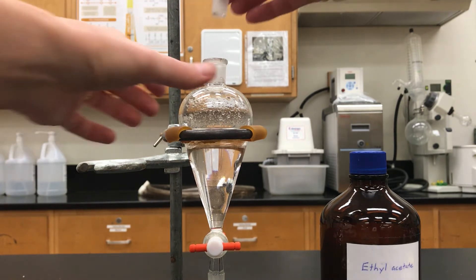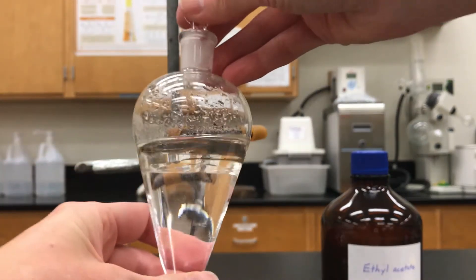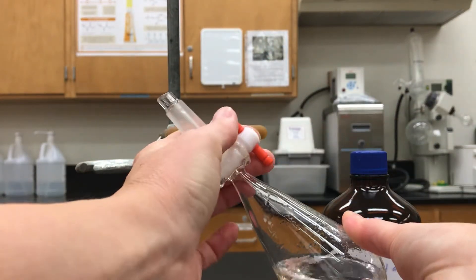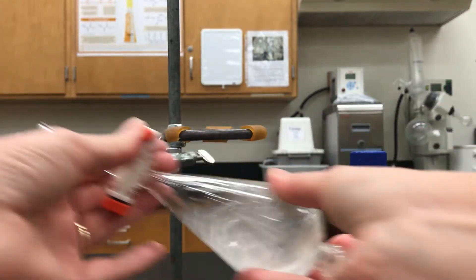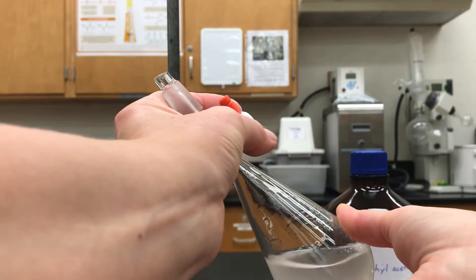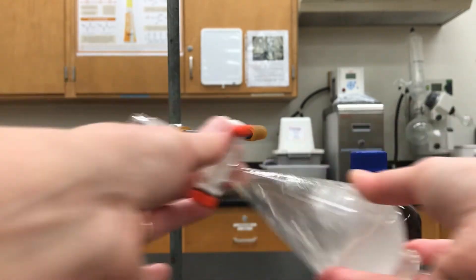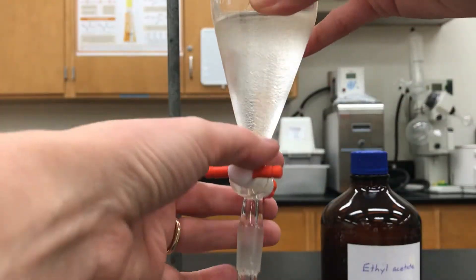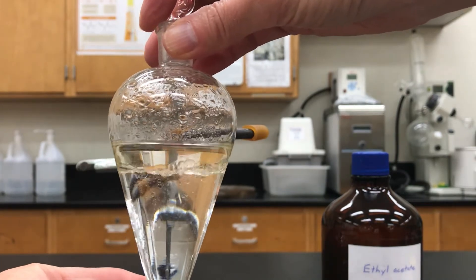I shake up the separatory funnel just like I did in the previous video. I put the stopper on, turn it upside down using two hands, give it a little vent, and give it a good shake for between 10 and 20 seconds. That's probably good. Now I let it settle down and let the layers form.